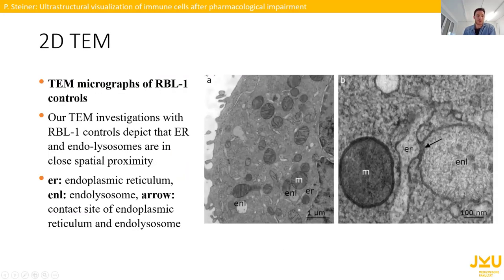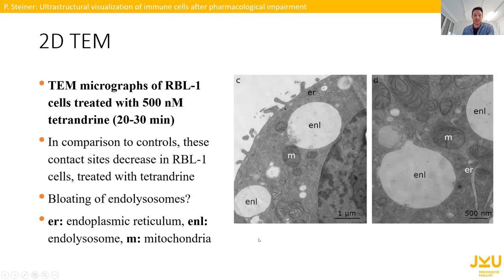This is a very low magnification overview of one cell. In an RBL-1 control, we can observe that there are actually contact points between the endolysosome and the ER. If we treat our cells with the plant alkaloid tetrandrine, these interaction or contact points between the endolysosome and ER are no longer visible in our two-dimensional data. This is very surprising for us. Also, the endolysosomes appear bloated in our tetrandrine-treated cells.